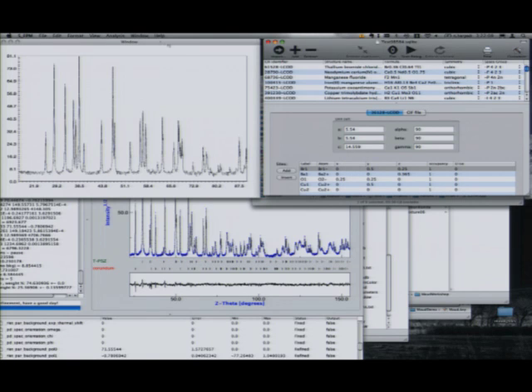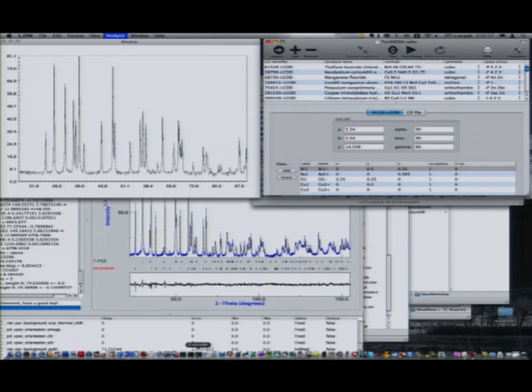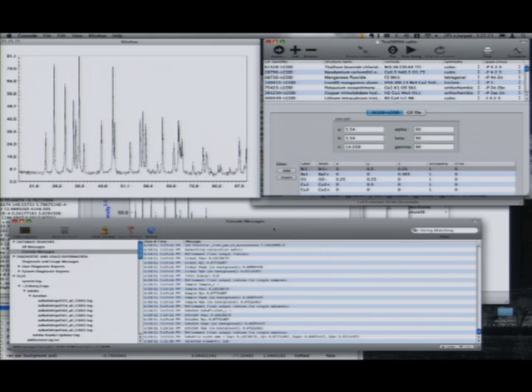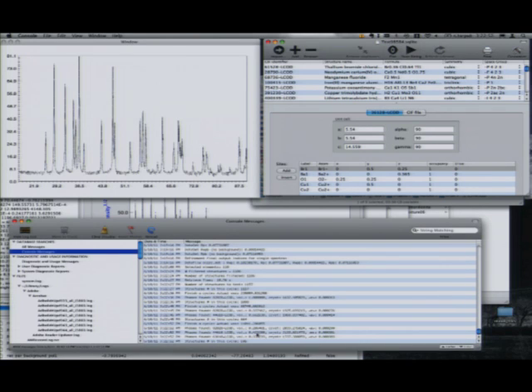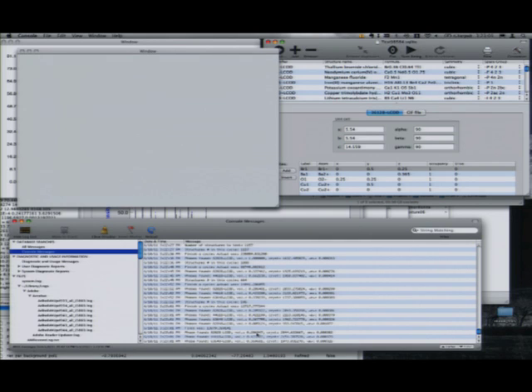Then you press OK, and then you go, okay, find best matching. Actually, this is something that was developed to work automatically, so you don't see too much. So you select 110 elements, and we have 1,200 phases. For each phase it does an automatic analysis, all through the 1,200. Then it selects the best one and puts it in. Then it starts again, does the second one, and puts it in again, until the last phase it finds is lower than a certain threshold.